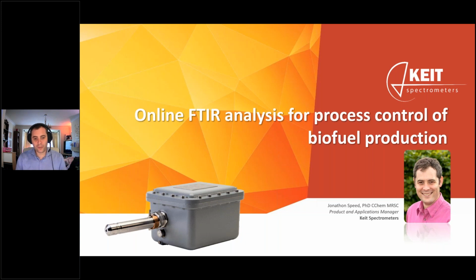I'm going to talk about the fundamental technology of how one would use FTIR for this type of application. Go through some of the basics of what makes this spectrometer a bit different to some others, and then go to look at some technical results towards the end of today's talk.